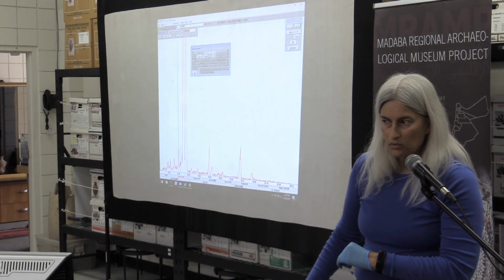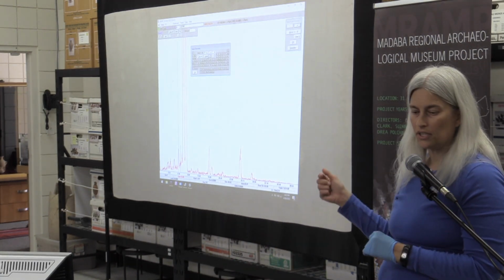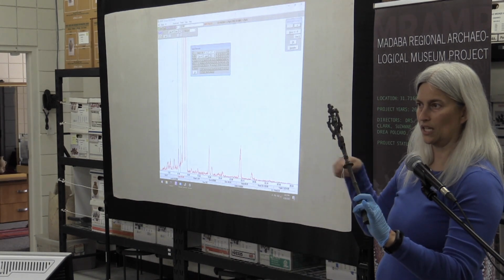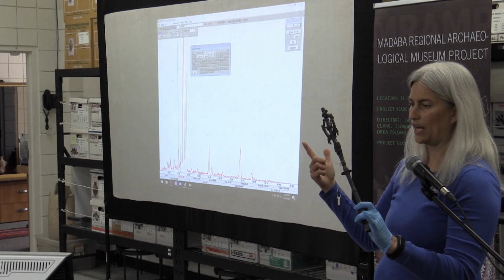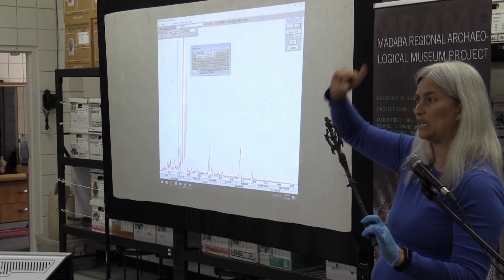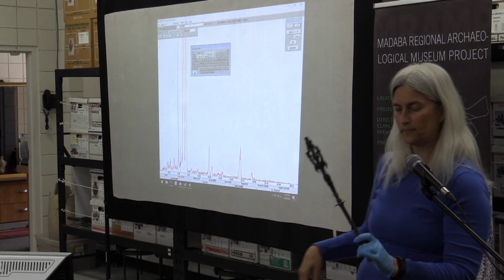Down there, we have a little bit of iron put in here. That's part of what's making this not super soft and just kind of bending in a wind, is it's got some other metals in it. So there's iron there, and you can see it's not very much. XRF does tell us relative amounts based on the peak height, how much of each kind of metal there is. So there's a little bit of iron in there.